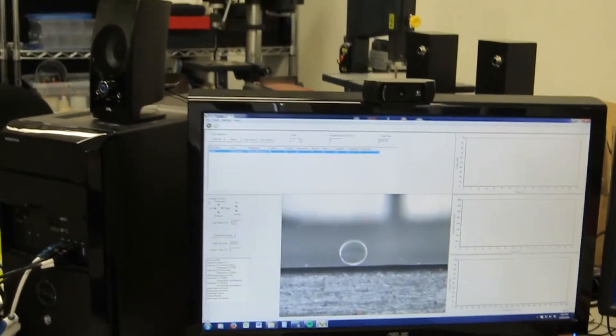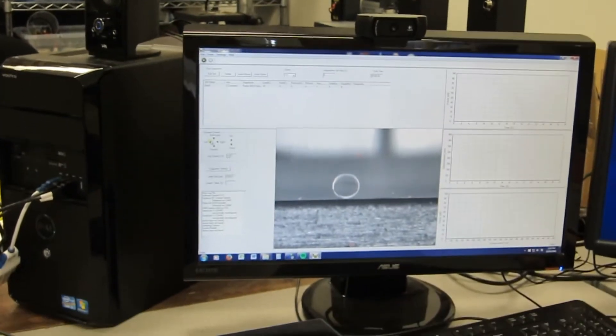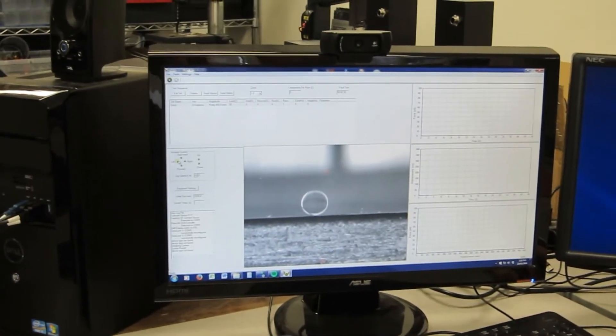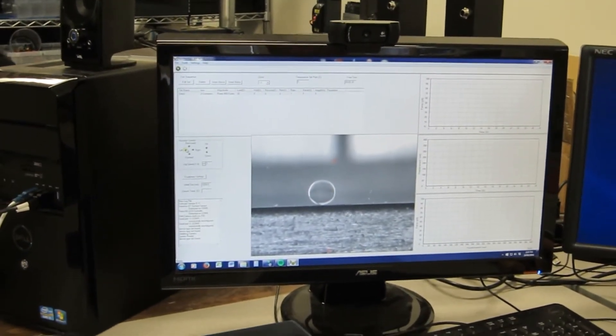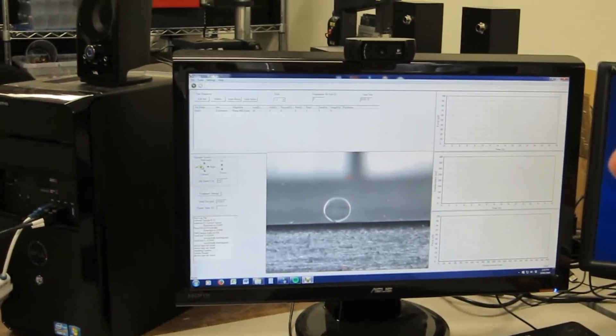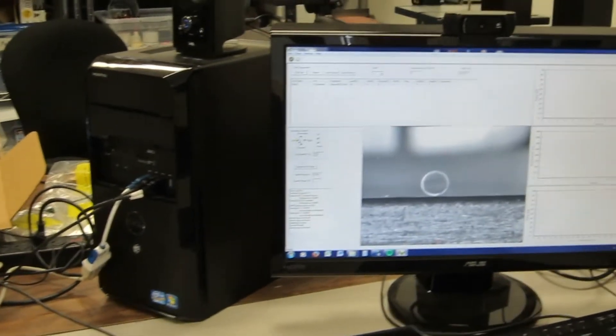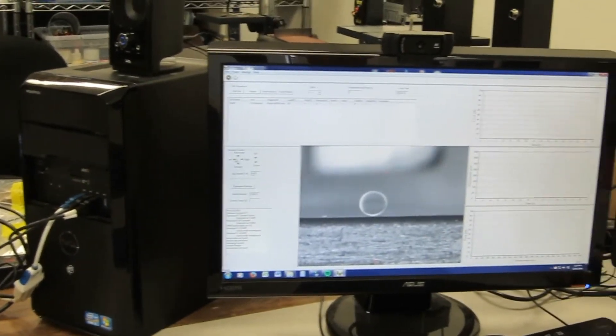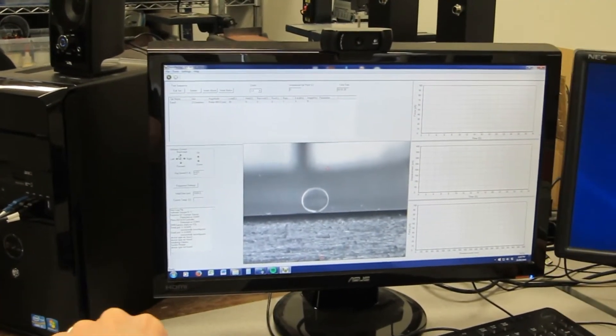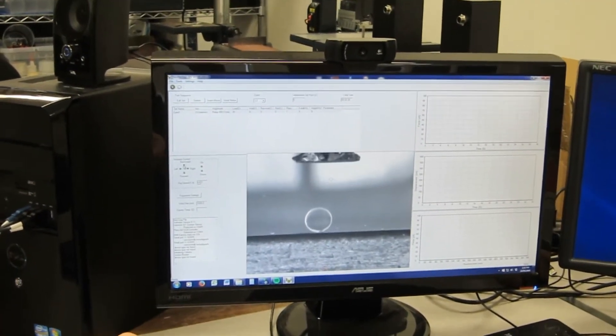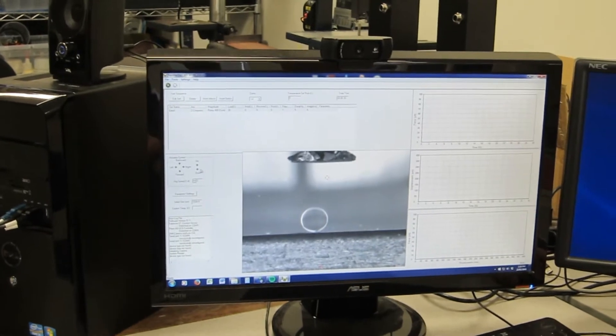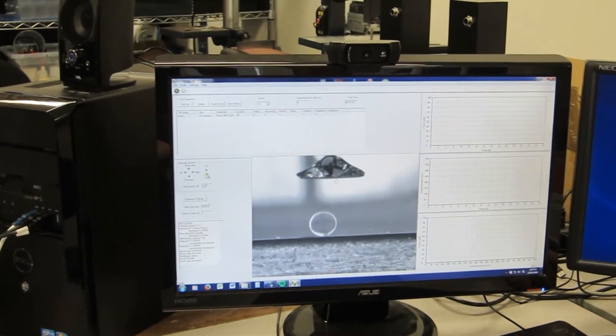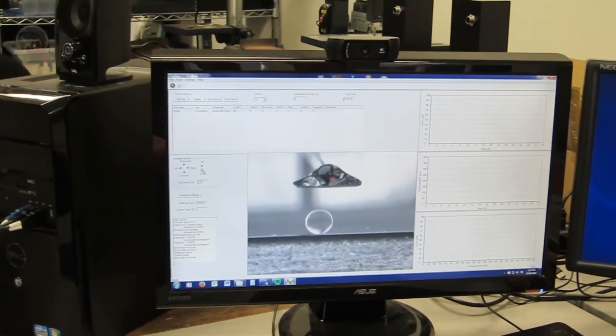So next thing I'll do, while I'm still at low zoom, is I'm going to bring over the top of the beam here. So I'll bring it over... might be out of the frame vertically actually, oh here it is, okay. And I'll bring that down to roughly the right position.